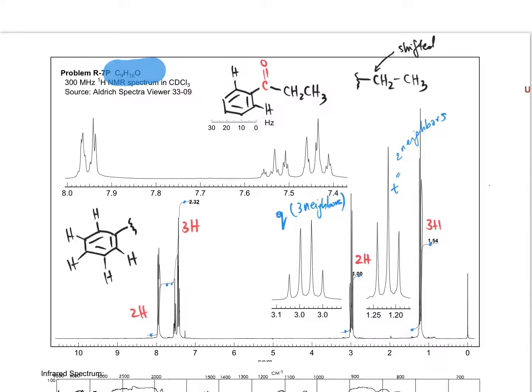What I want to highlight here is that these protons are too far to be split by anything on this side of the molecule. These split each other, but they don't see the other side of the molecule.